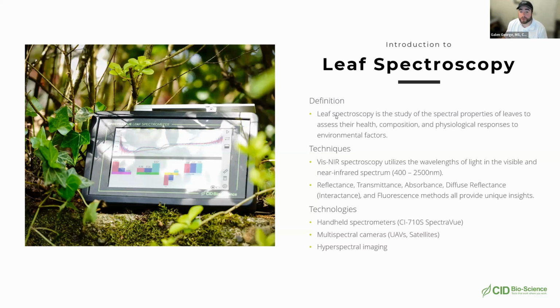Is this device pre-calibrated to measure leaf nutrient content? If yes, what crops are calibrated? It's a great question. We don't have any calibrations on the device for any crops right now. What we have are nutrient indices that aren't quantitative, but qualitative.